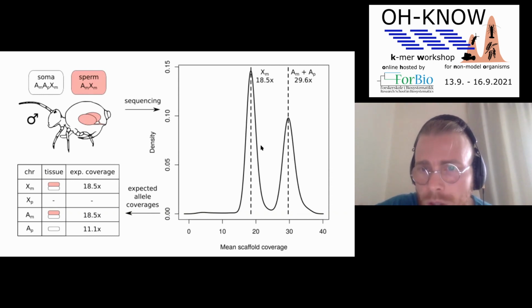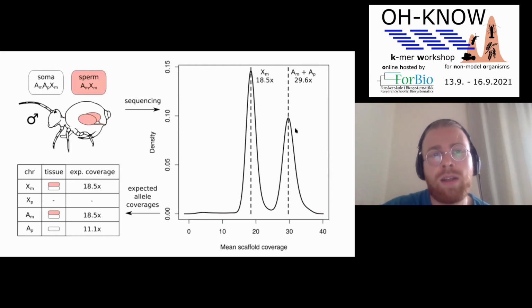It is better, okay. So is this spectra for all genome reads or sex chromosomes only? It's always for all genome reads. Oh yeah, all genome reads, I believe. It's wild how k-mer spectra can only vary that much, but the interpretations are vast depending on the biological system. I think this is a really huge point of this workshop too. You cannot ignore the rest of the biology of your system. You always need to know what you're doing. And k-mer spectra is just another indication, another sanity check, another way to look at it.